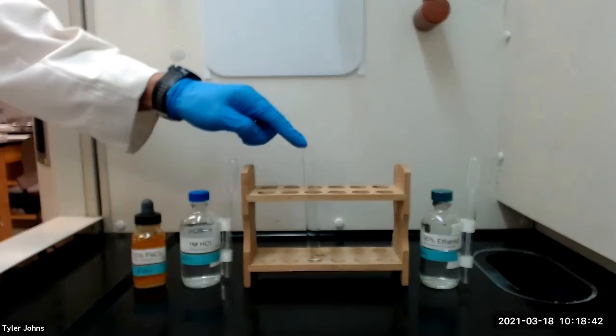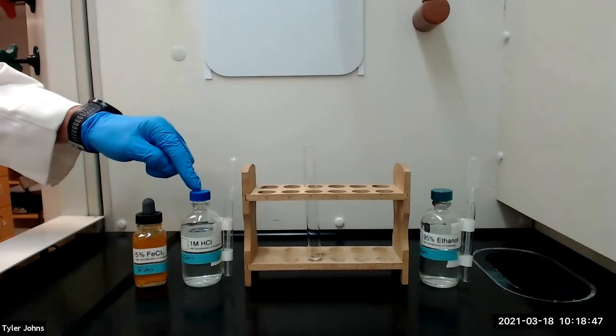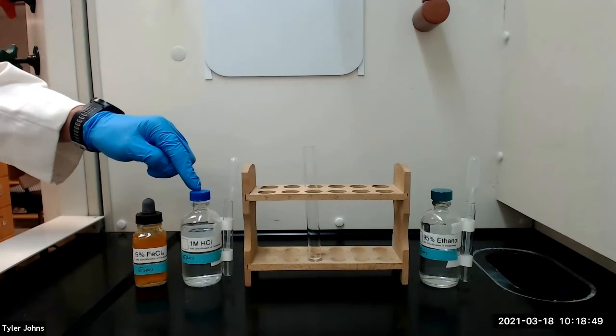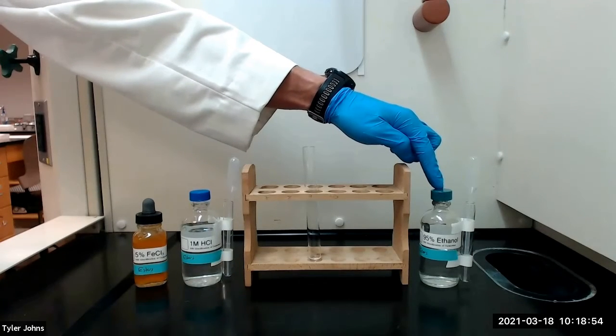After removing the solution from the heat and allowing it to cool, we will add two milliliters of one molar hydrochloric acid. If the solution becomes cloudy, we will need to add two milliliters of 95% ethanol to clarify it.